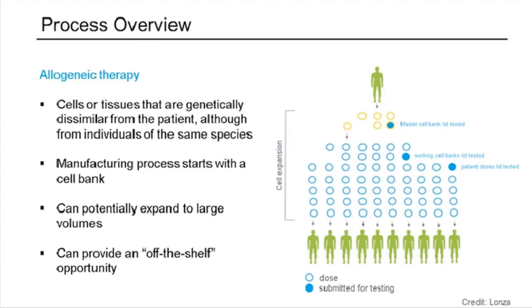And this allows for an available range of scale because you could potentially be producing this product line in bulk or for multiple patients at a time. It is important to note that there is allogeneic donor match products where you are basically matching from a specific donor to a specific patient. So that would be performed more on a patient-specific scale. But if it's non-patient specific, that can be produced in bulk, and so you can get up to larger scale production volumes.